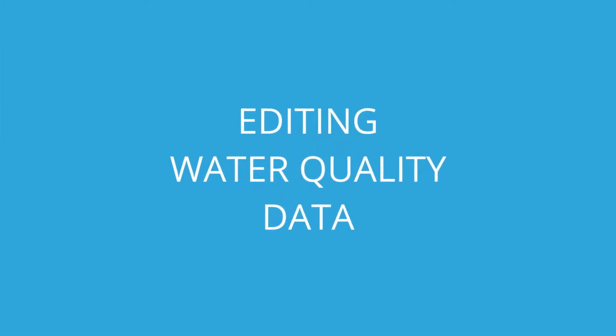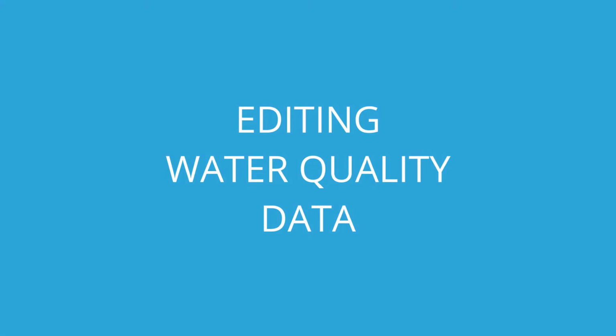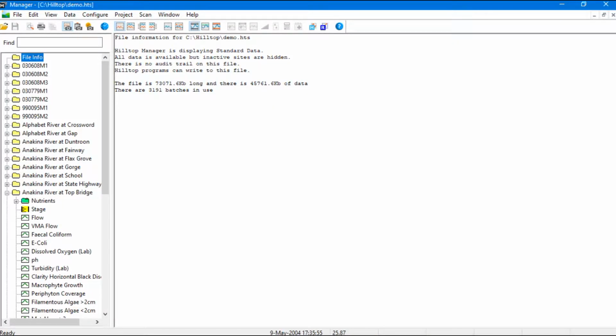In part 2 of a 3-part series on editing data in Manager, here I look specifically at editing water quality data. You can in fact edit a water quality measurement in the same way as any other sort of measurement, so if you haven't done so already, you need to watch the first video in this series, Editing Measurements and the Grid Control. When editing a water quality measurement, you have the option of seeing all the measurements in the grab sample and can edit everything at once, and it's this option I talk about in this video.